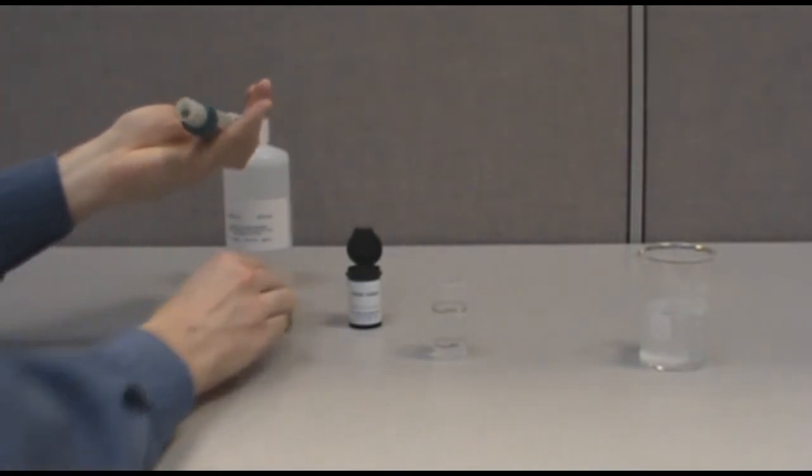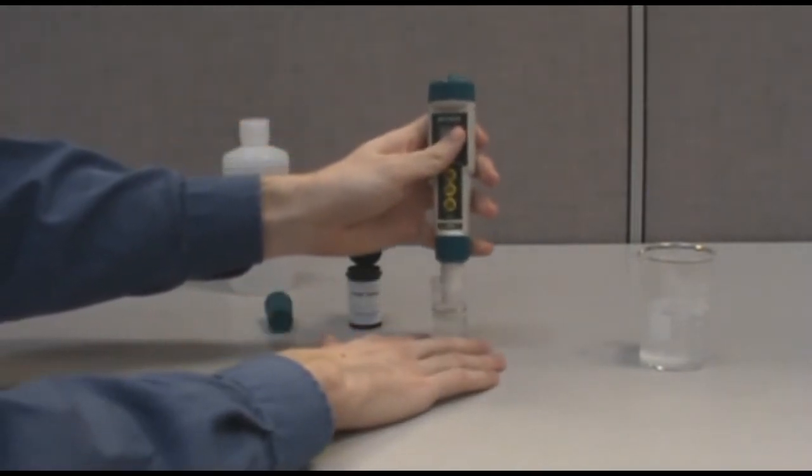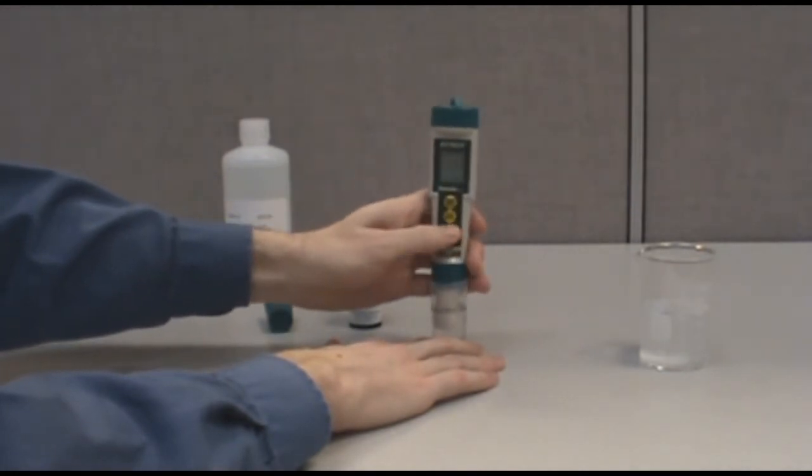Place the meter into the standard and switch on the instrument using the on-off key. The meter will then go through its internal calibration.